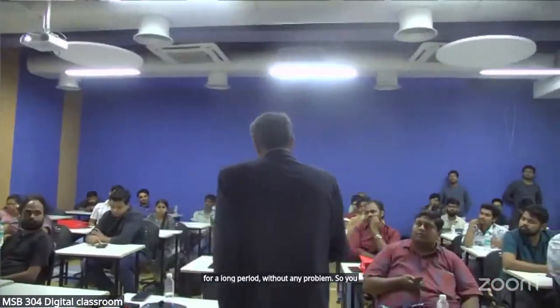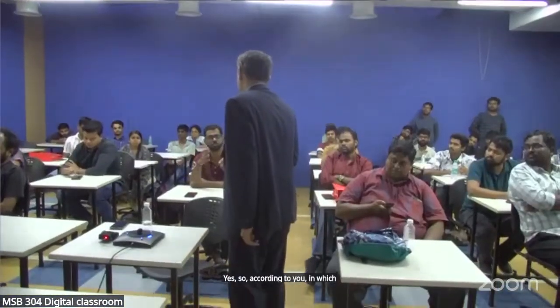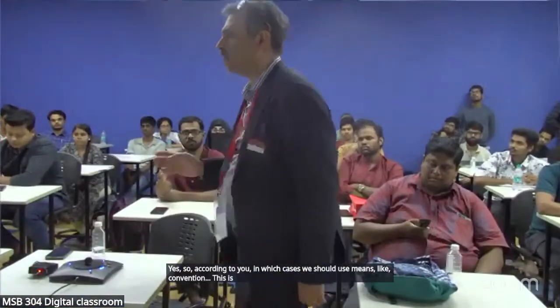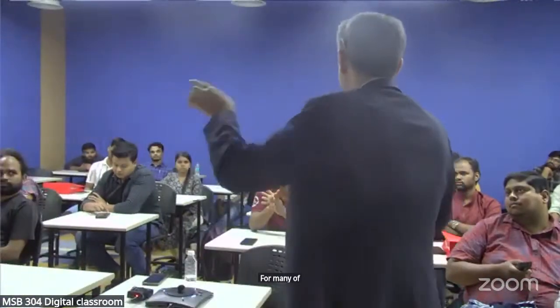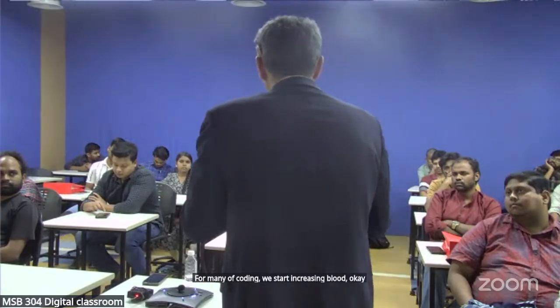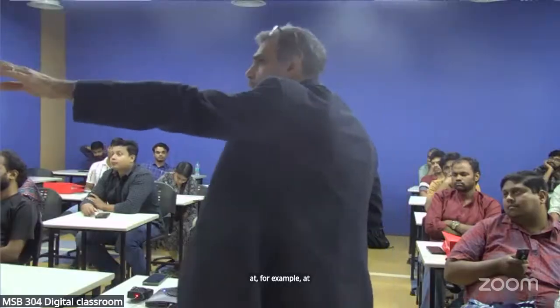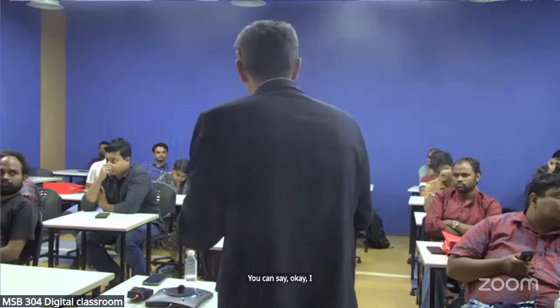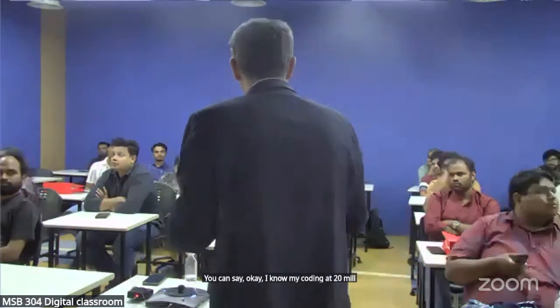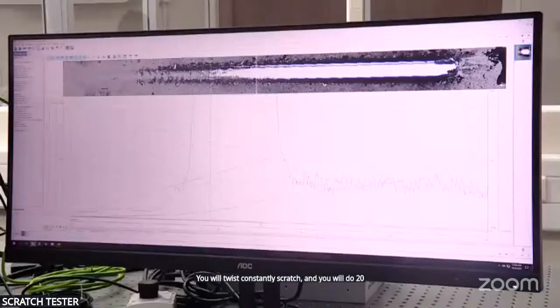So you have three loading modes now: constant load, then progressive, then incremental. Yes. So according to you, in which cases should we use each? This really depends on the application. For example, progressive is the best method for many coatings, where we start by increasing the load. But imagine you have a coating that you know will be removed at 20 Newton. You can say, okay, I know my coating will be removed at 20 Newton. You will fix a constant scratch load and do 20 Newton, 20 Newton, 20 Newton.